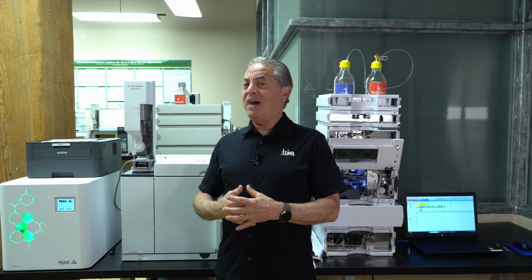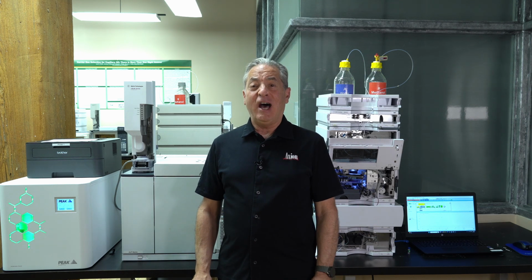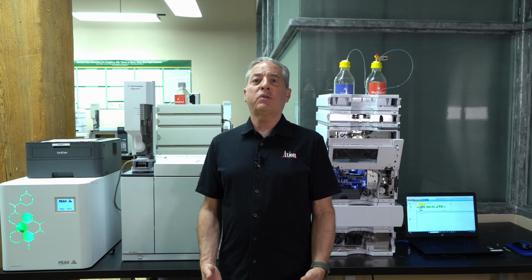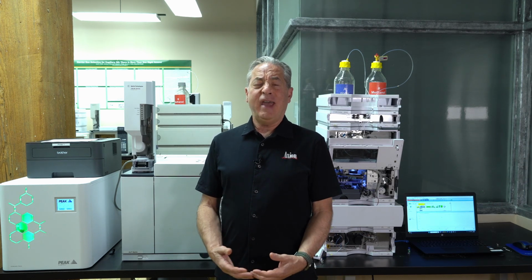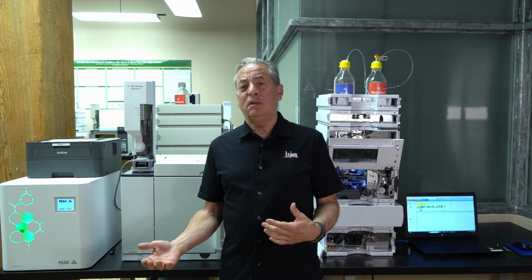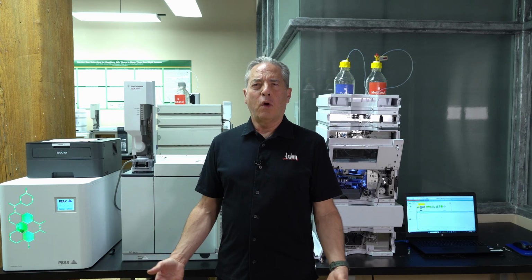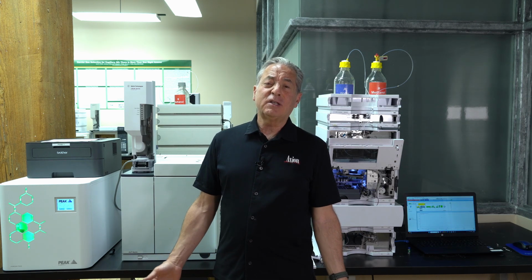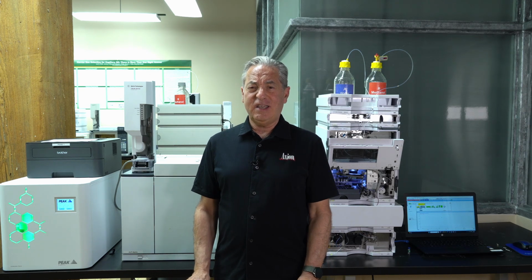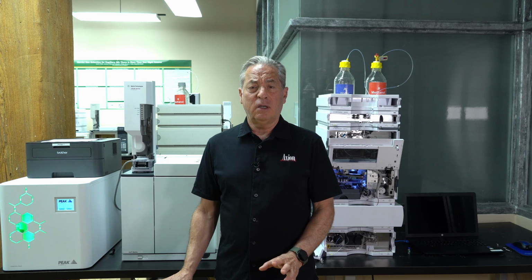In GC, we have a dozen detectors, but there's one that dominates. It's the flame ionization detector, the FID. It dominates because it can see anything with carbon-hydrogen bonds, which is any organic material on the planet. So since most things we do in GC are organic, this is the perfect detector for most things. Great detection limits, part per million, subpart per million detection limits, and easy to use. So in the GC world, pretty simple answer. FID is the number one, the major detector.